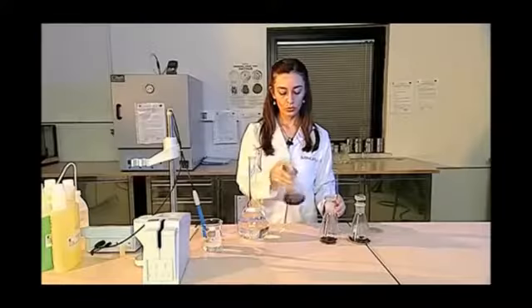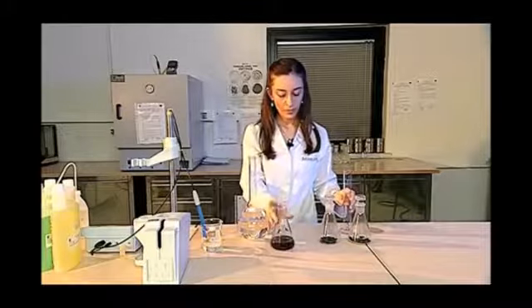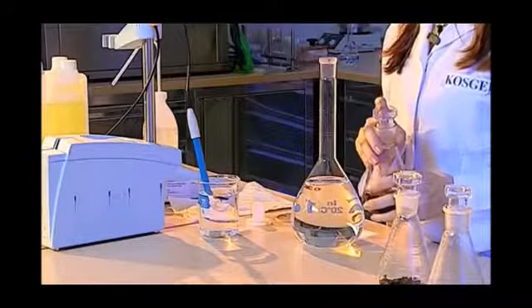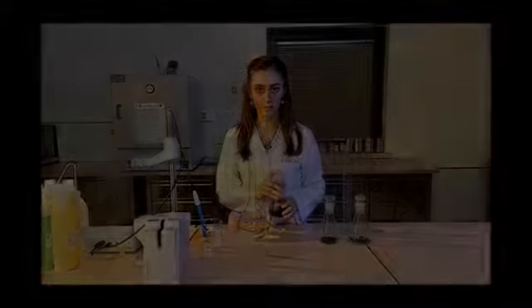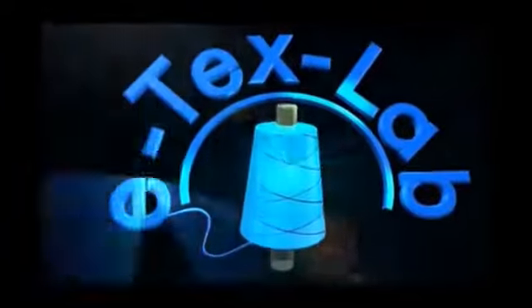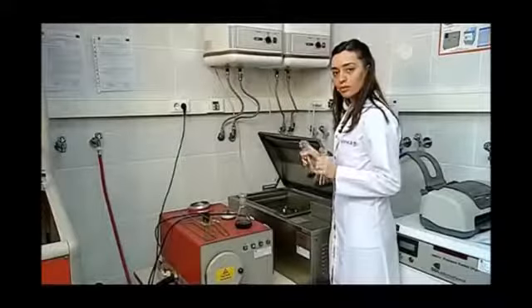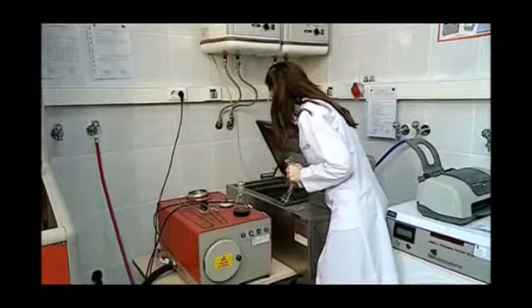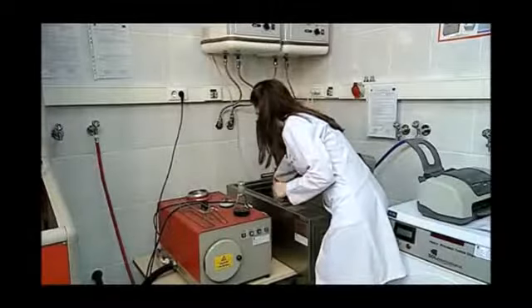In this way, I apply the solution. The next thing to do is to place the prepared sample inside the mechanic beater and leave it exposed to the churning process for 2 hours. Our prepared test samples that are put into the mechanical beater, which moves back and forth 60 times per minute, are shaken for 2 hours.